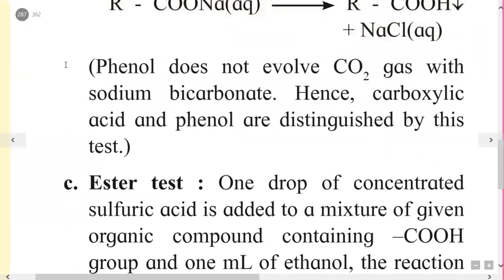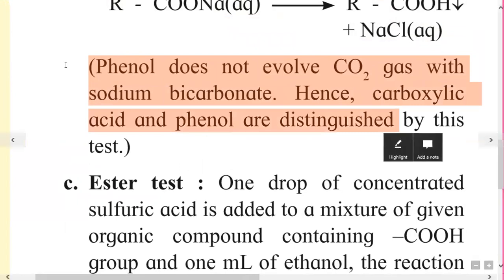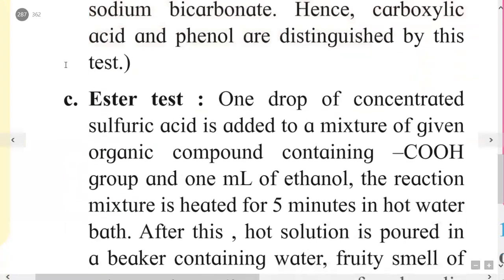Phenol does not evolve carbon dioxide gas with sodium bicarbonate. Hence, phenol and carboxylic acids can be distinguished by using the sodium bicarbonate test. The next test used for the identification of carboxylic acid is the ester test.